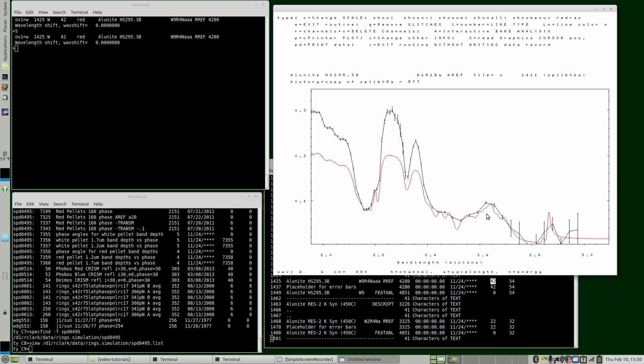So for brighter things, so brighter wavelengths, the small spot size loses some photons because the area of the spot is very small. So some photons get lost from being counted. So as the signal gets brighter from multiple scattering, there's a greater departure. But where the signal is lower due to absorption in the sample, there's a better match. That explains that.